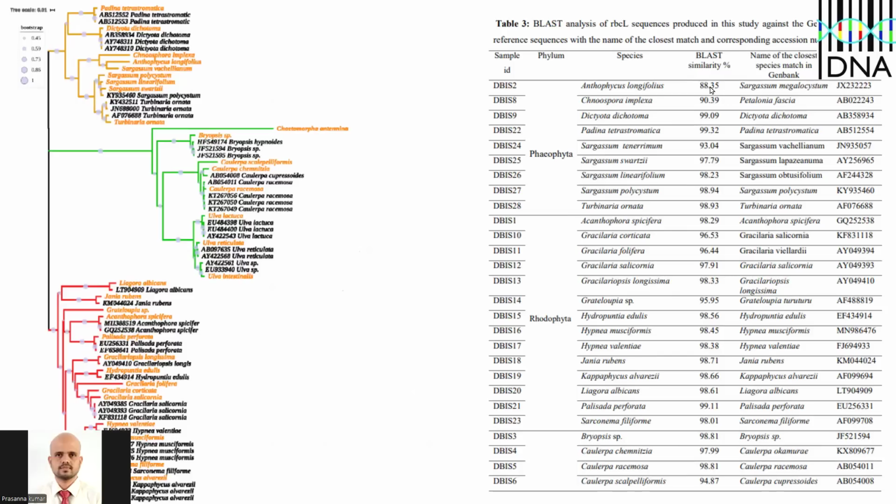See, the BLAST result clearly says it is only 88% similarity, meaning this genus or family itself is not there in GenBank. Okay, this is to be barcoded. See here, similarly 90%, 94%. These species are not yet in GenBank. They can be barcoded for the first time. It's very advantageous, and I know many PG students here are aspiring for a publication. In this research, barcode gap analysis and first-time barcodes are actually an easy way to publish. I will show you how.